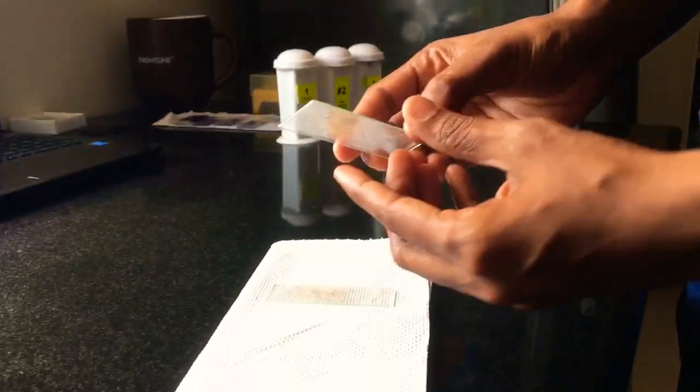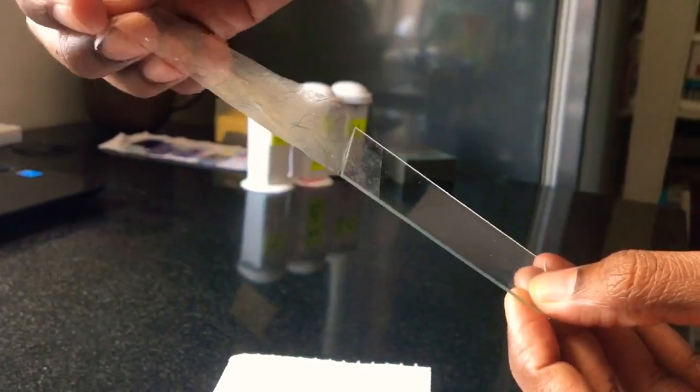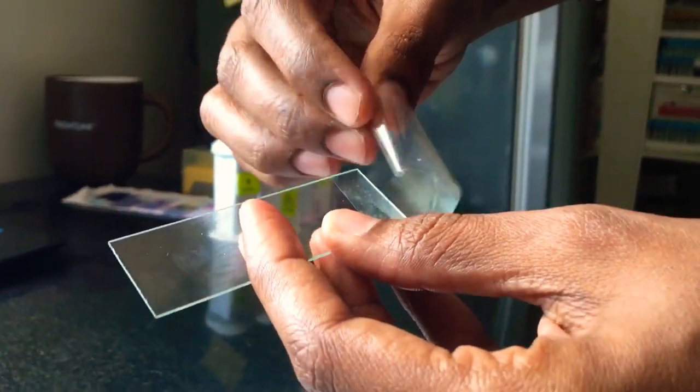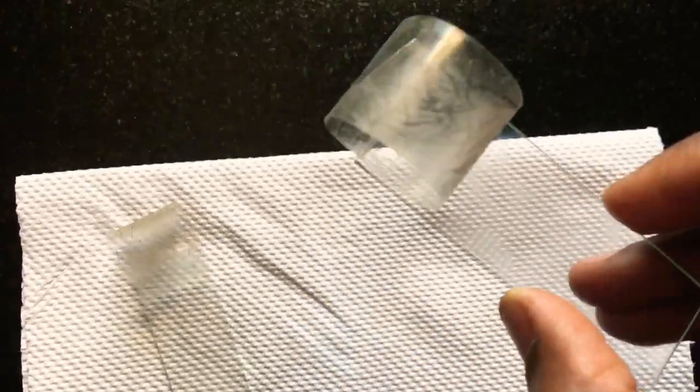The first important thing you need to do is gently peel off the tape from the slide, leaving one end of the tape attached to the slide. Fold the other end and make it a loop. By making a loop, it will be easy for us to proceed with the staining.